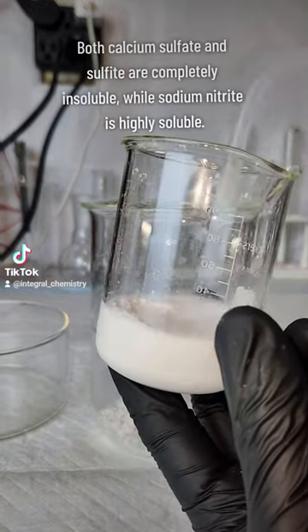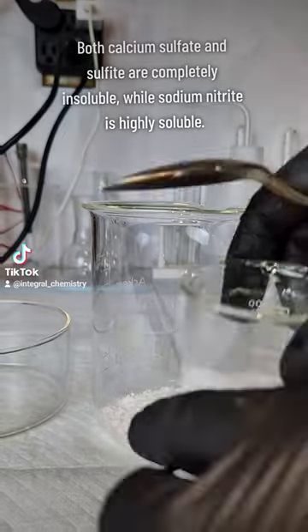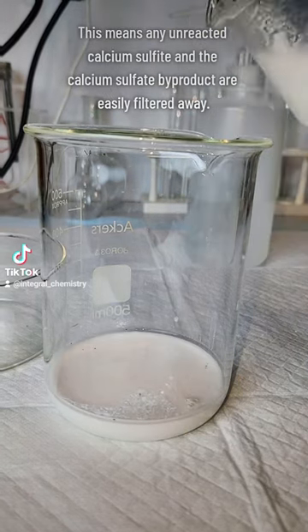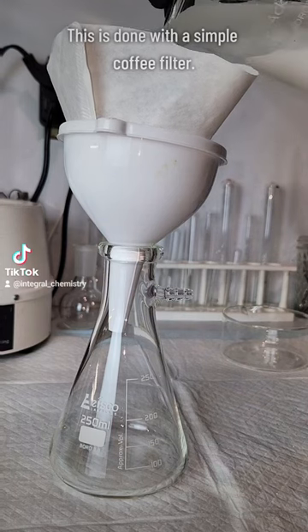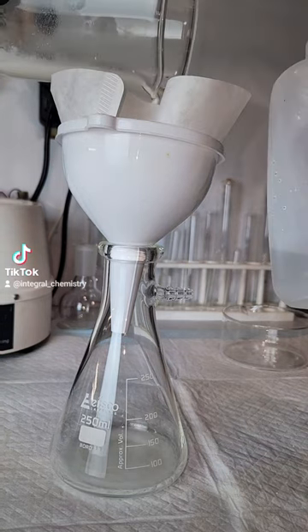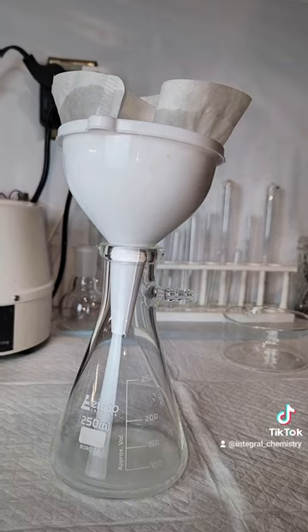Once the reaction is finished and the beaker is cooled down, I transfer my crude product to another beaker. I use a little bit of water to help get it out, and this is totally fine because calcium sulfate, the byproduct, as well as calcium sulfite, which was a reagent that may be in excess, are both completely insoluble in water, and I filter them away in the next step anyway. Sodium nitrite, however, is extremely soluble in water, and all of it should be rinsed through and wind up in my Erlenmeyer flask.